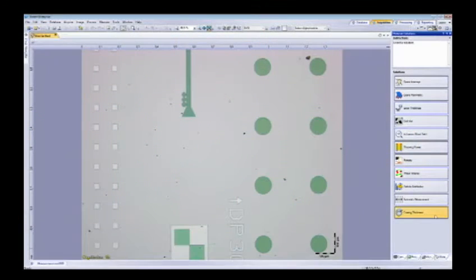Can you show us a couple of those? Yeah, two of the new ones that we added to Stream 1.9 are automatic measurement and coating thickness. Automatic measurement is just that. The software can take a motorized stage and drive around and take automatic measurements of patterns. These patterns can be repeatable in different areas. There might be something where the customer is looking at a pattern and they want to take it off, process, like polish or do something else to the sample, put it back on and move right back to that.